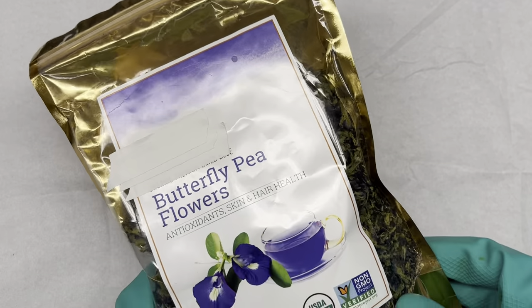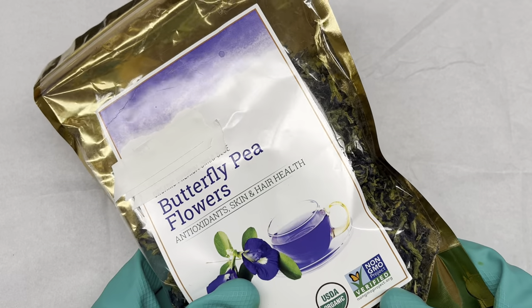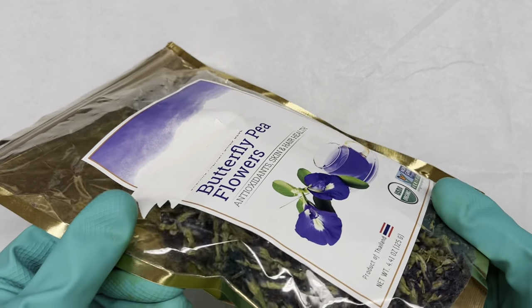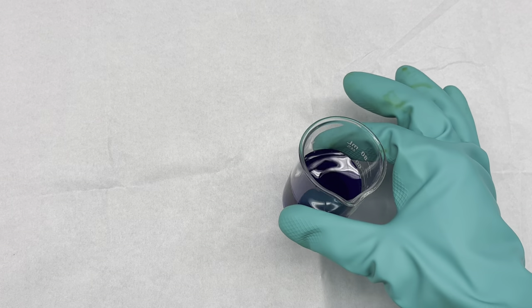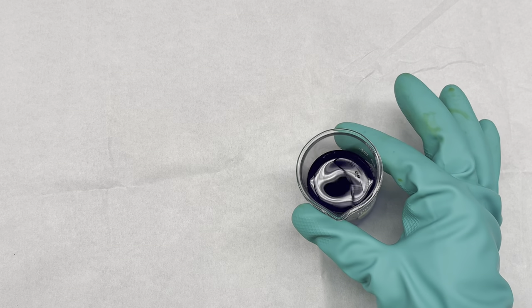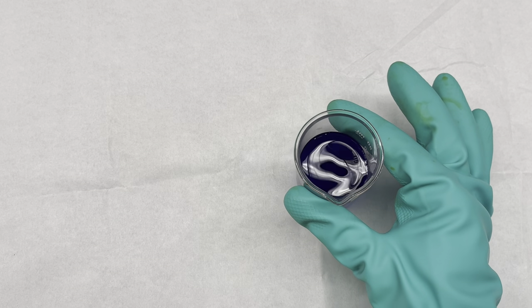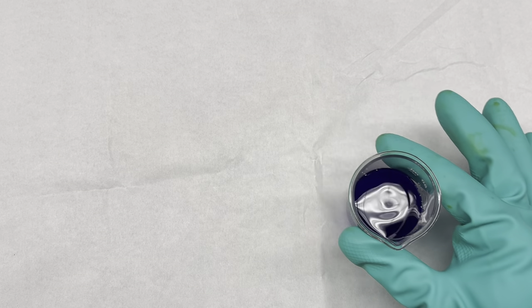I recently learned about butterfly pea flowers and how you can take these dried flowers, put them in hot water, and brew them into a tea that has a whole bunch of anthocyanin compounds. Here is what the tea looks like — this bluish color in deionized water. We filtered this to get the flower pieces out. With all these anthocyanins making this pretty blue color, we can use this as a really nice indicator.